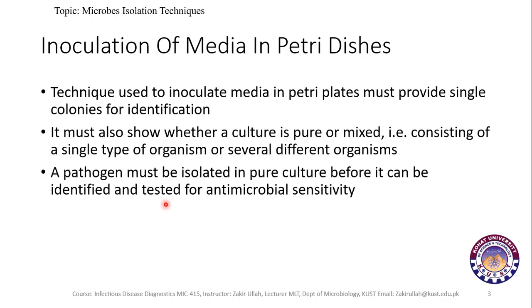A pathogen must be isolated in pure culture before it is identified, before it is reported, and before it is tested for antimicrobial sensitivity.